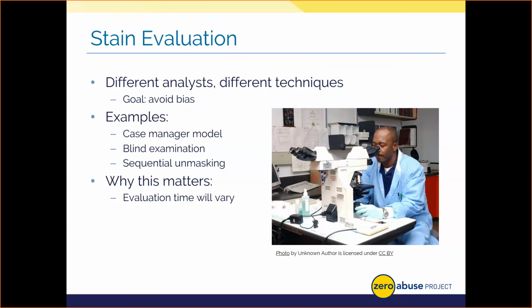Let's cover, just for the sake of time, a few popular examples. Under the case manager model, managers will be fully informed about case context and where items might be inundated with potential biological evidence, while examiners are provided only basic information needed for the specific testing tasks they're asked to perform. They may know they need to look for a stain, in fact, not much else. The case manager can then provide additional insight on an as-needed basis to avoid bias from creeping into the analyst's decision-making.